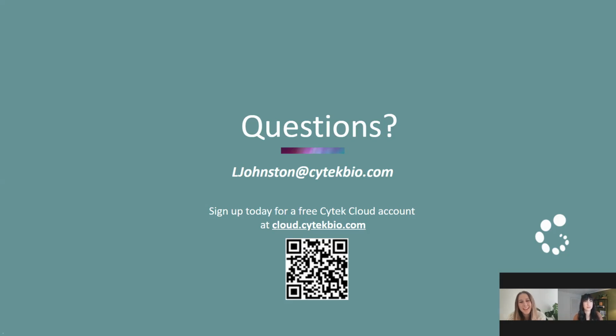Thank you. And we'll wrap with this last question: do you have a recommended viability dye? Yeah, so on a spectral system, to give you the maximum number of fluorophores available, I would say Live/Dead Blue, Viadye Red and Zombie NIR are ones that are nice solely because they just don't share any similarity to any fluorochromes that you would want to use for an antibody. But ultimately, you can use whatever viability dye you want, unless you have a highly autofluorescent sample, then I would recommend using something excited by a red laser.